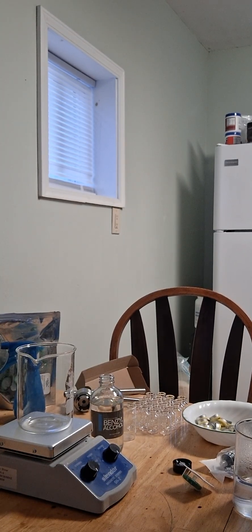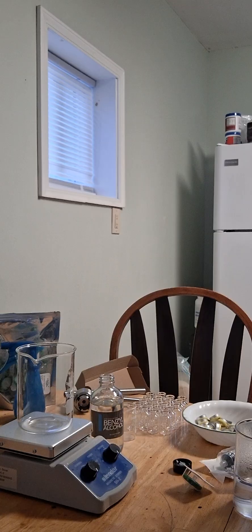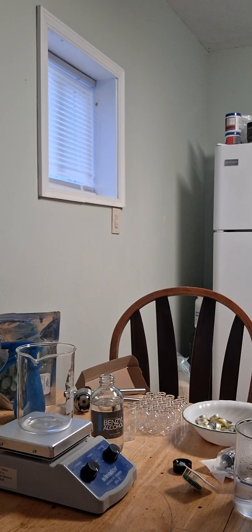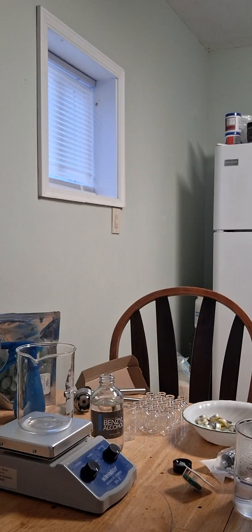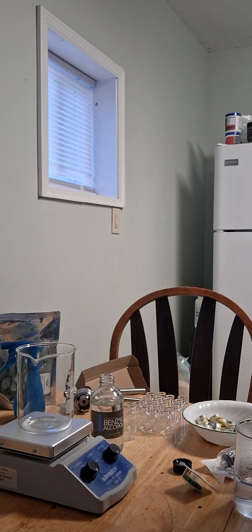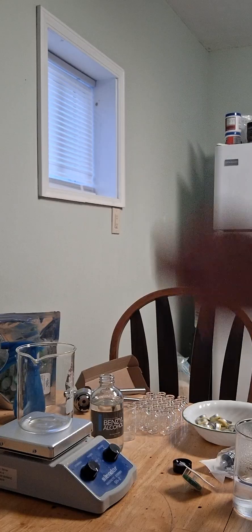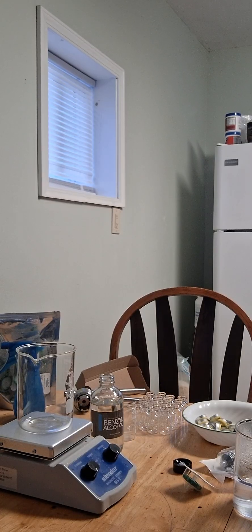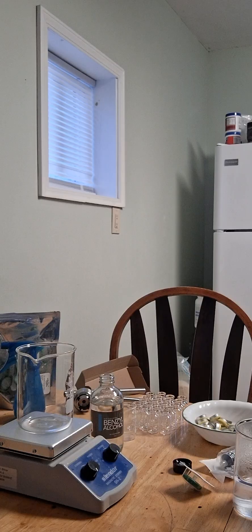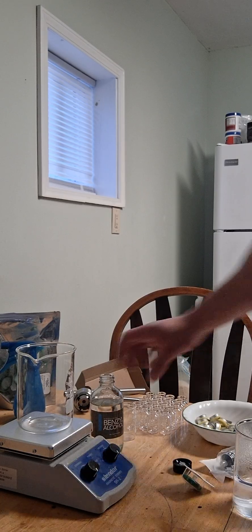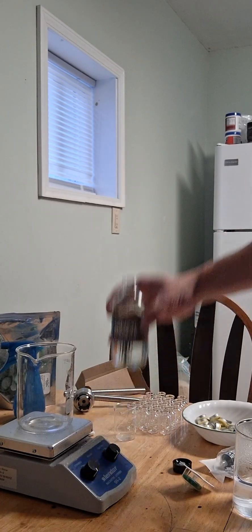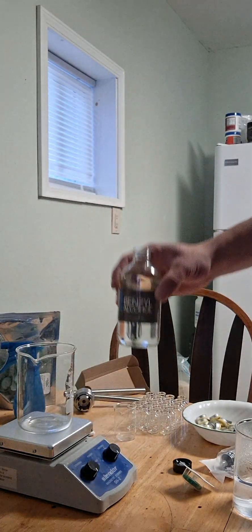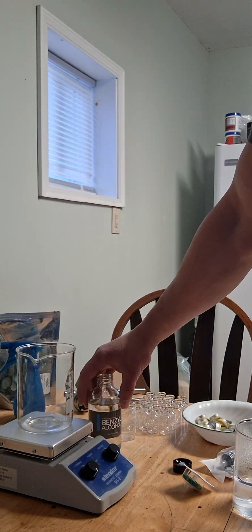Okay, disclaimer: this video is for educational purposes only. This is not to be used for human use or veterinary use, strictly for education and entertainment only. So I'm going to give you a brief walkthrough of how to make bacteriostatic water.